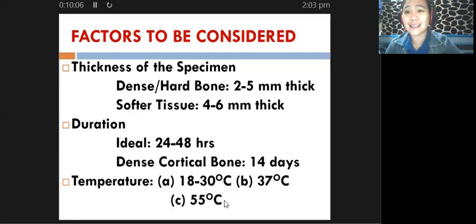In English, if you are going to perform decalcification at 55 degrees Celsius, and when you go back after 24 hours, it's gone already. You just left for approximately 1 day, and then when you came back, everything is gone. Your tissue sample has undergone complete digestion already.